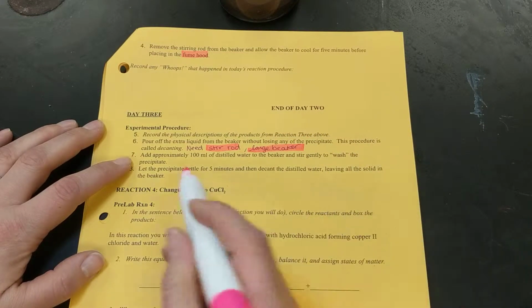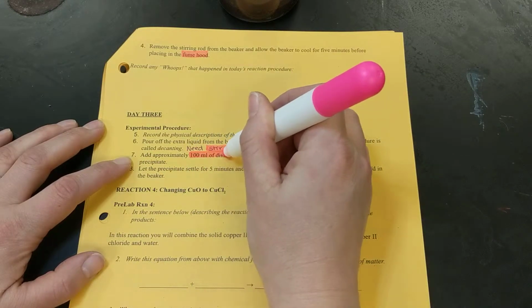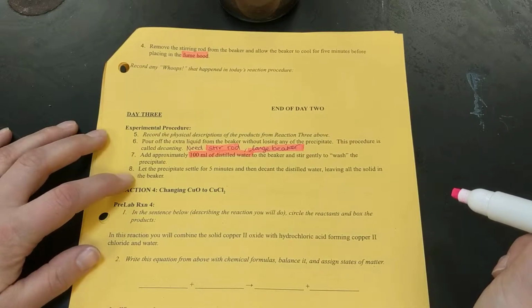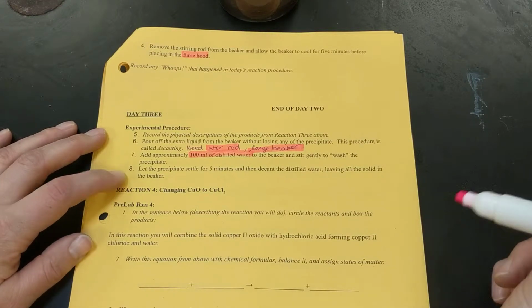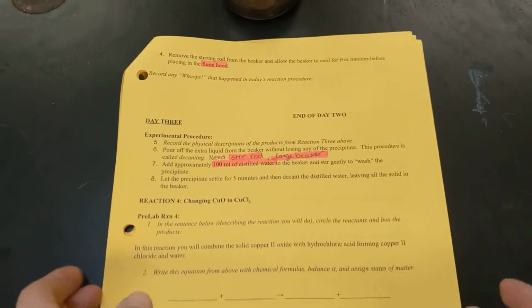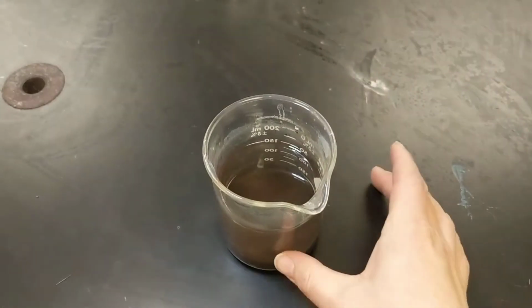It then says we also need to add approximately 100 milliliters of distilled water. So we need to add distilled water to the beaker to gently wash the precipitate. We'll let the beaker settle for 5 minutes and then decant the distilled water, leaving all the solid in the beaker. So I'll go ahead and show you how to do that. Decanting can be a little tricky, and it takes a little bit of practice, and you might lose a little bit of your solid here. That's pretty normal, but it'll get easier as you practice.